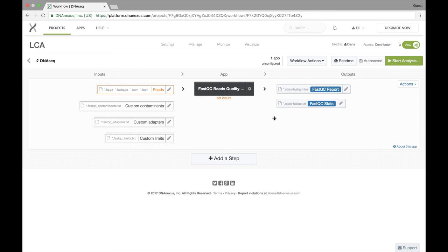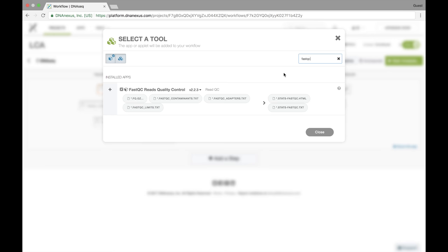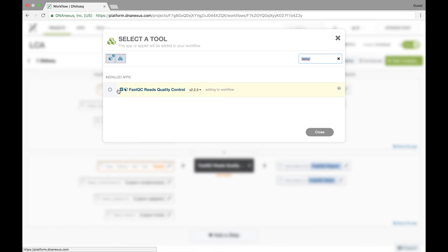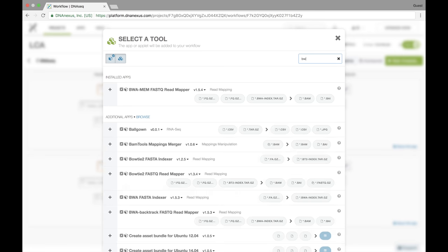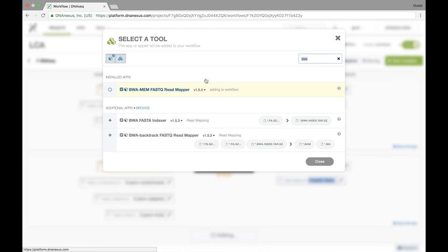But we're not done yet. I'm going to add a couple more steps. I'm going to add FastQC again but this time for the reverse reads. And then I'm going to add BWMM for our mapping step.